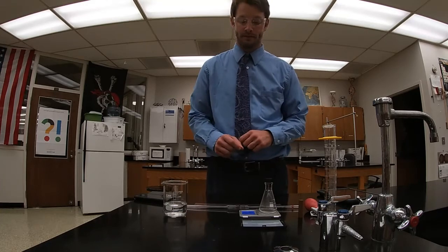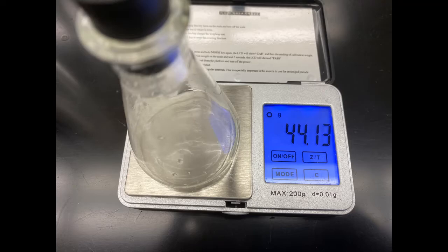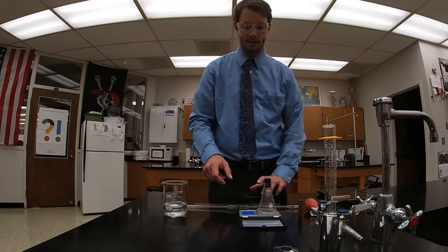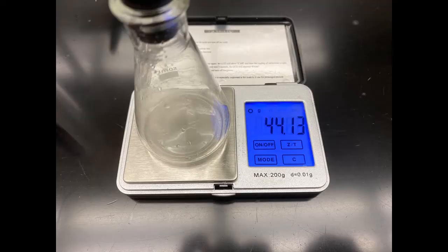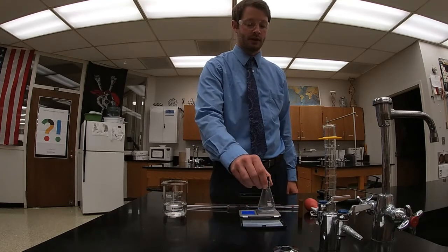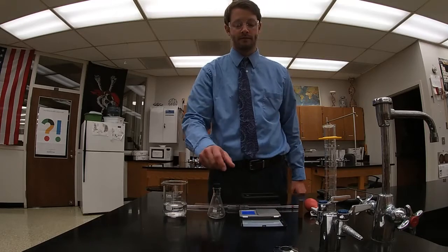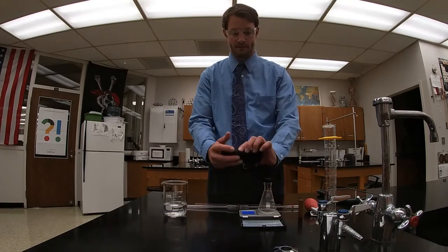Take the first mass, take it off, tare it, take the second mass, take it off, tare it, take the third mass, take it off, tare it, take the fourth mass.